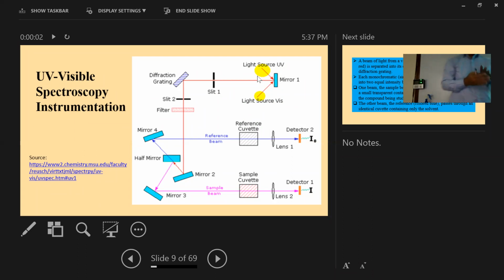For any light, if you have a mirror at a 45-degree angle, the light will go back the other way. Because you are familiar with the rule, the incident angle and the reflected angle will be the same, relative to the perpendicular.